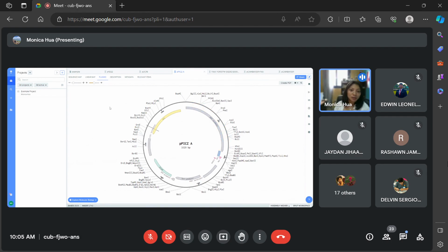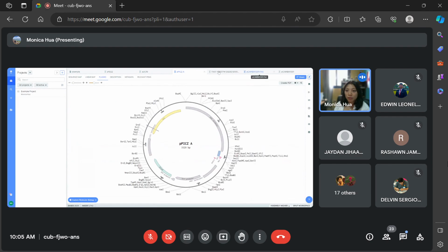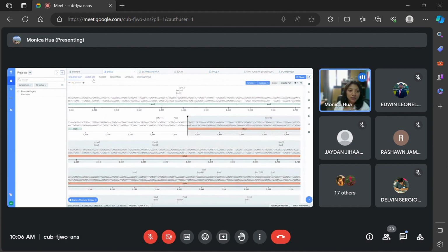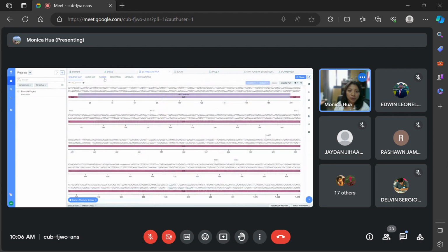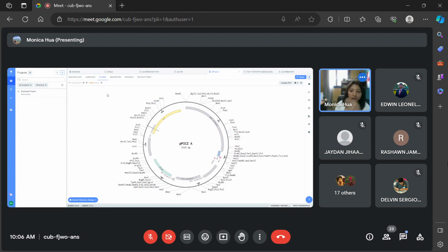So once you feed it methanol, it's going to start secreting your proteins. Okay, so now I have all of them here. Let me bring pCAMBIA up here. Now I have four of these vectors. Let me do the plasmid map just so I could look at them better.